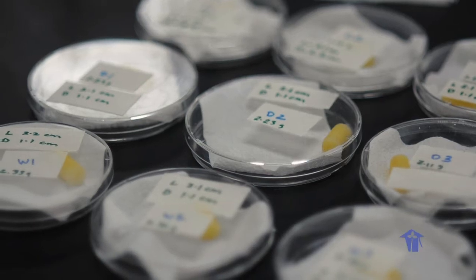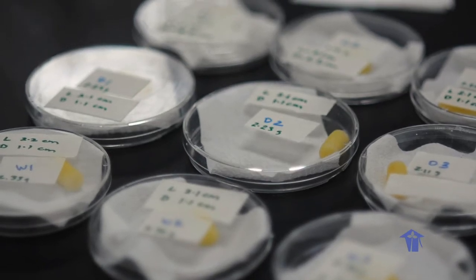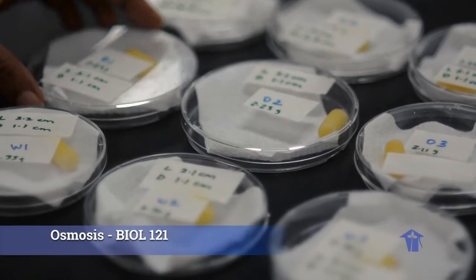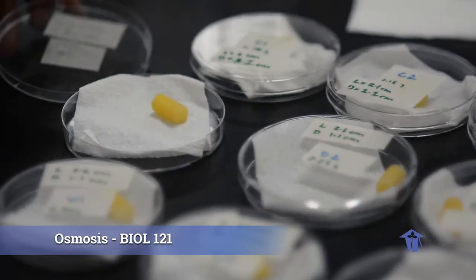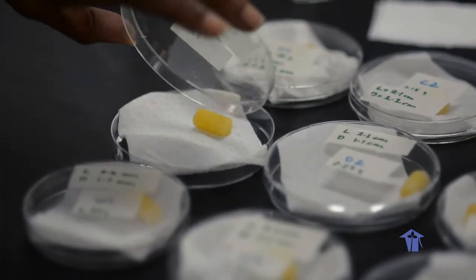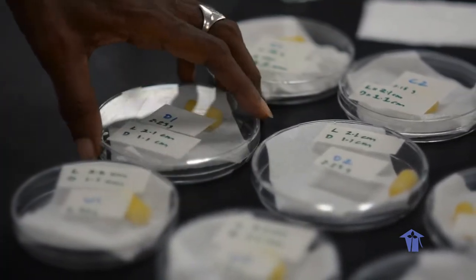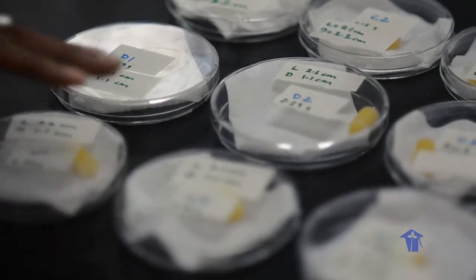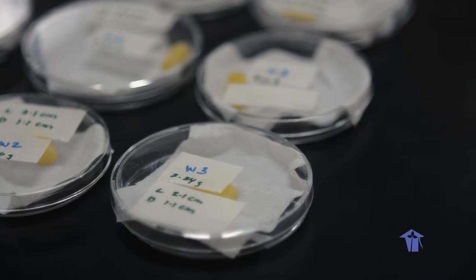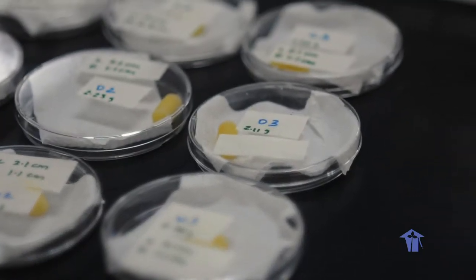Today we are looking at osmosis using one type of plant tissue. We are using pieces of potato, Irish potato, for this particular experiment. Now, what we've done here, we have three different experimental conditions set up.